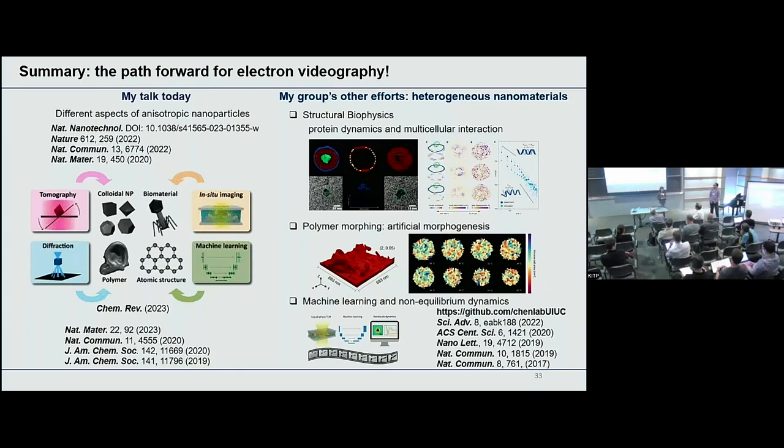So there is an interplay between the nanoparticle diffusional dynamics versus our temporal resolution. Right now, the best temporal resolution of movie taking is about a millisecond. So you can imagine if the particles are diffusing faster than that, then for each image you're basically taking a blurry image. That's why you can have those connections, but those are not real physical connections. And the reason why this is so good for self-assembly studies is because once the particles are self-assembled, the diffusion is significantly lowered. That's how we can see single particles really clearly after they are assembled.